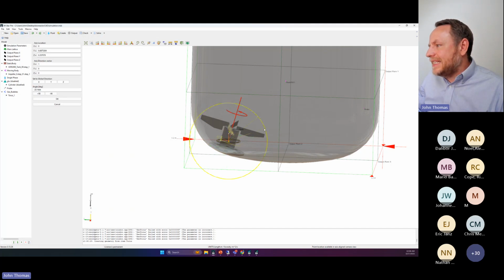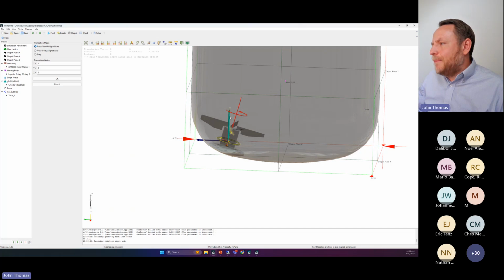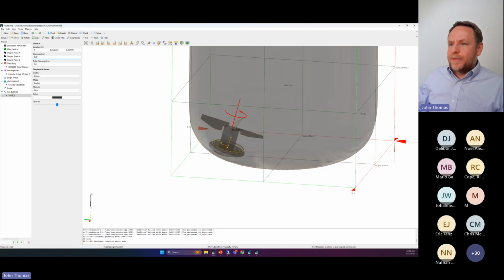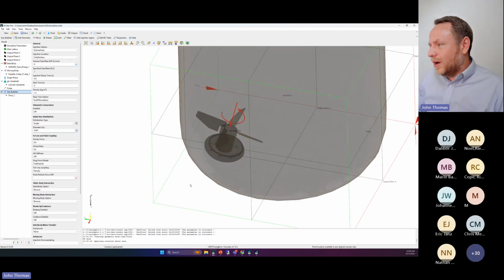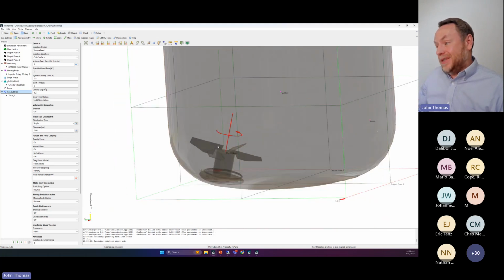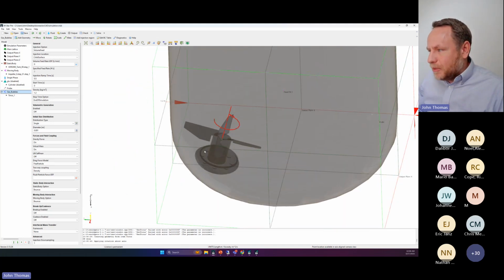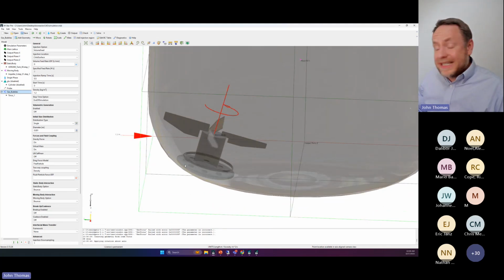This is the lazy man sparger, where it's like, you know what? I've got bubbles coming in somewhere down below the impeller. It's good enough. I'm just going to have them go in there, and I'm going to start with the lazy man's, then I'll do the sophisticated man sparger. But to be sure, it's probably not a bad approximation. It's not as good as the microsparger, but foundationally, I just say that bubbles are coming in everywhere along the surface.